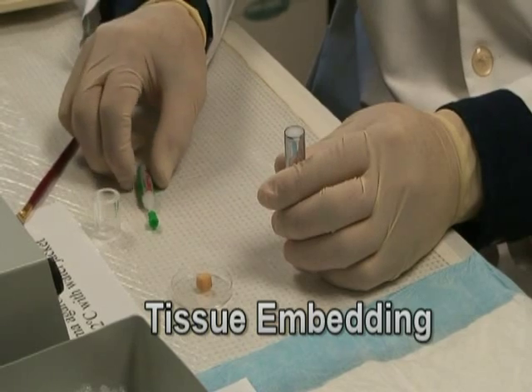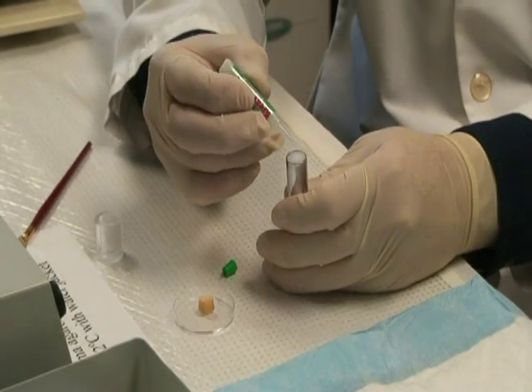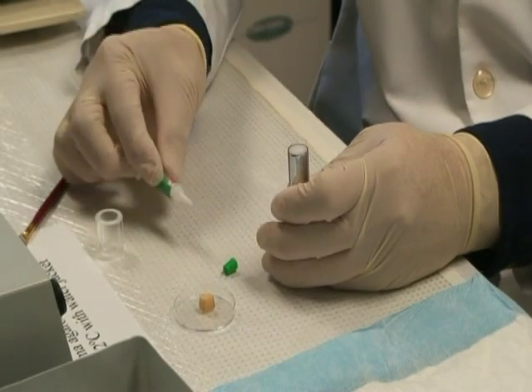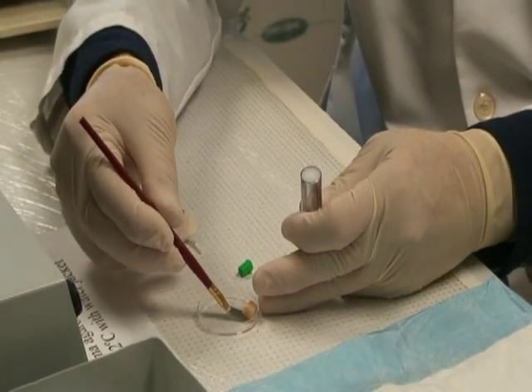Tissue embedding. Apply a small drop of glue on the plunger. Glue the tissue on the plunger.